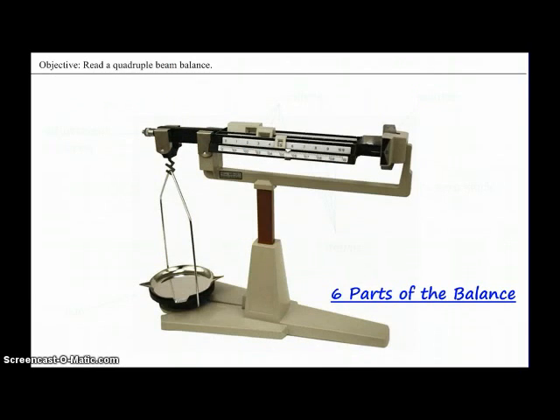There are six parts of the quadruple beam balance. The first part down here is called the pan. This is where you put the object that's being massed. On the left hand side of the arm is the adjustment screw. The adjustment screw is used to zero out the balance before you start to mass an object.